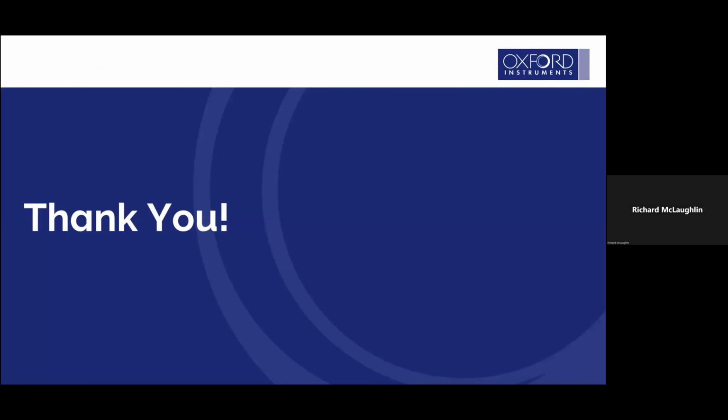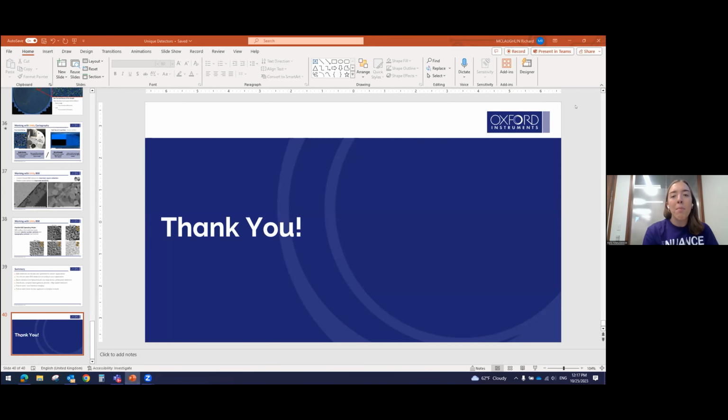Thank you. Any questions? Again, thank you for your talk. I'll be moderating the questions again. As a reminder, please put any questions into the Q&A section at the bottom of your screen. So the first question that we have here is, can the Ultim Extreme, similar to other EDS detectors, be configured spatially to work with simultaneous EBSD?